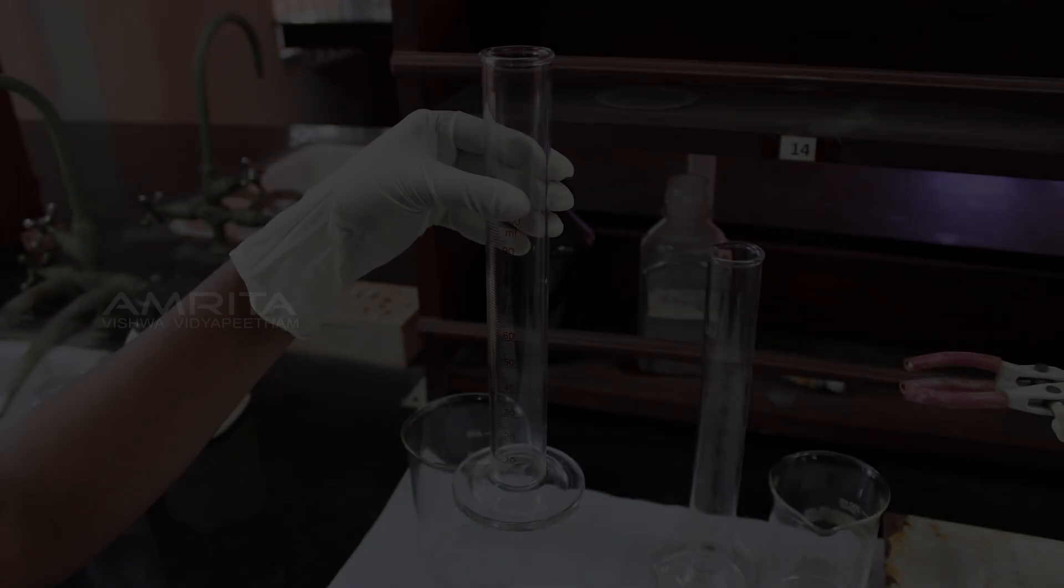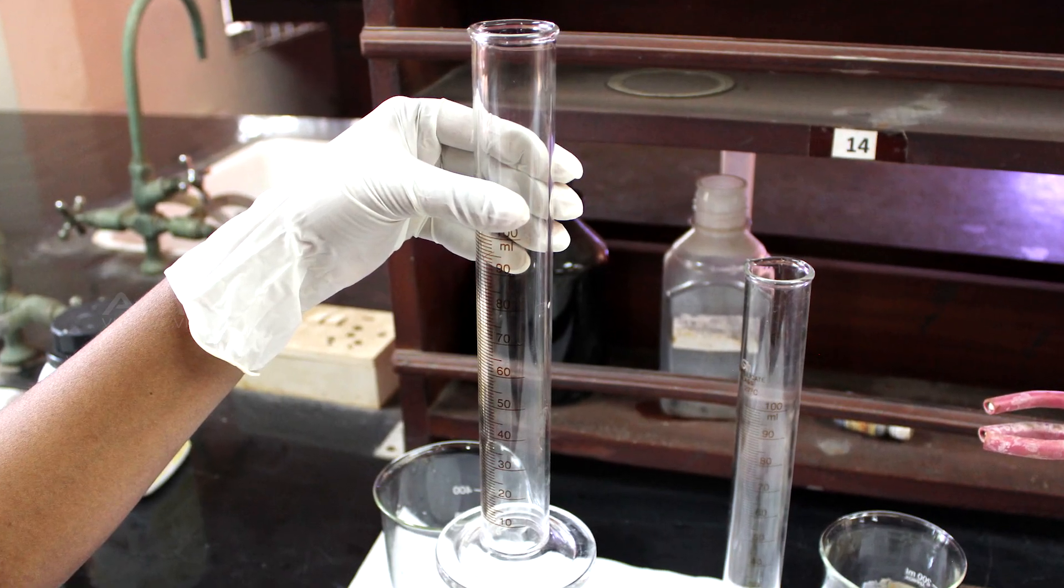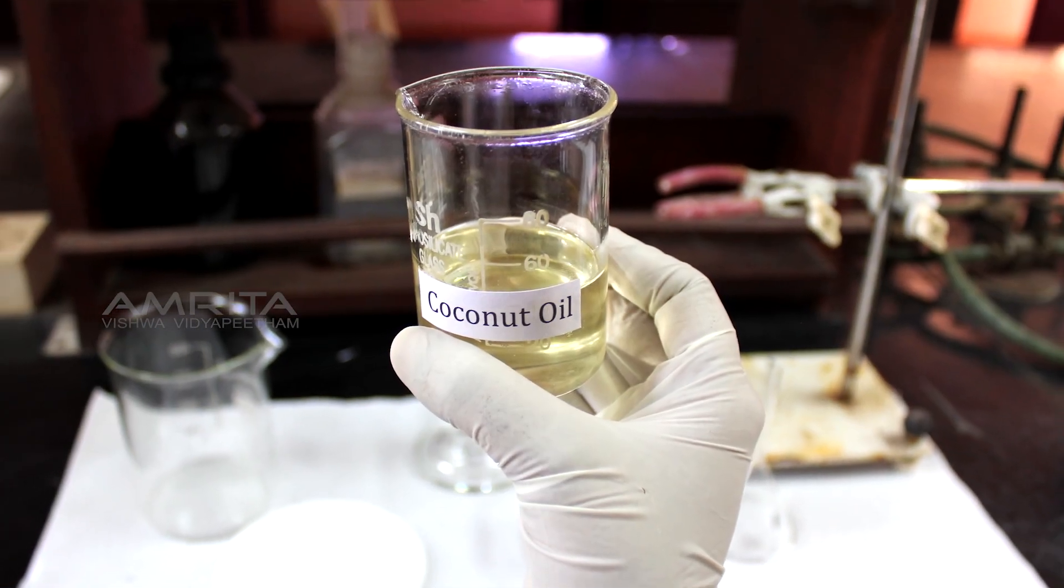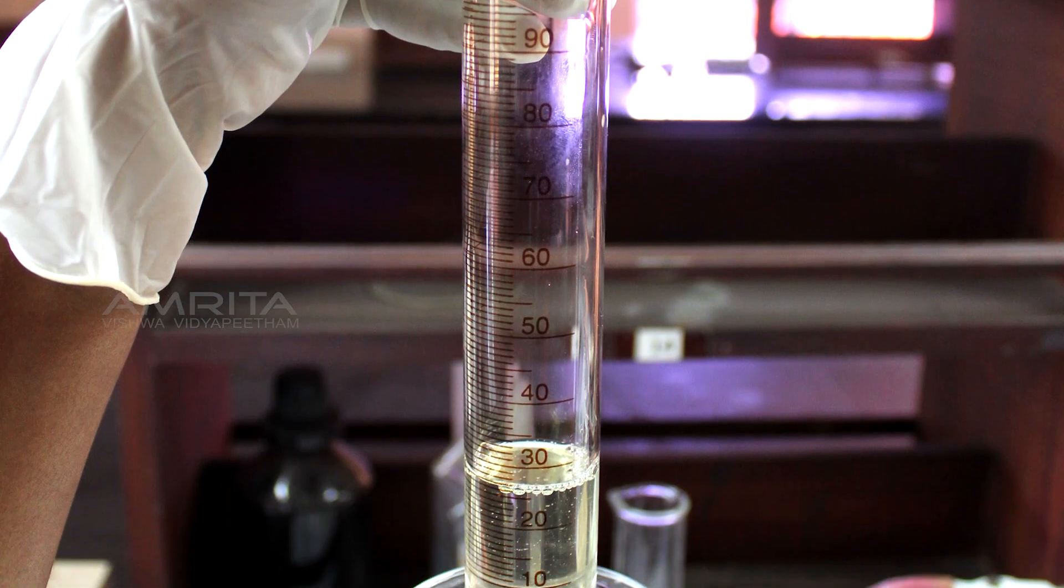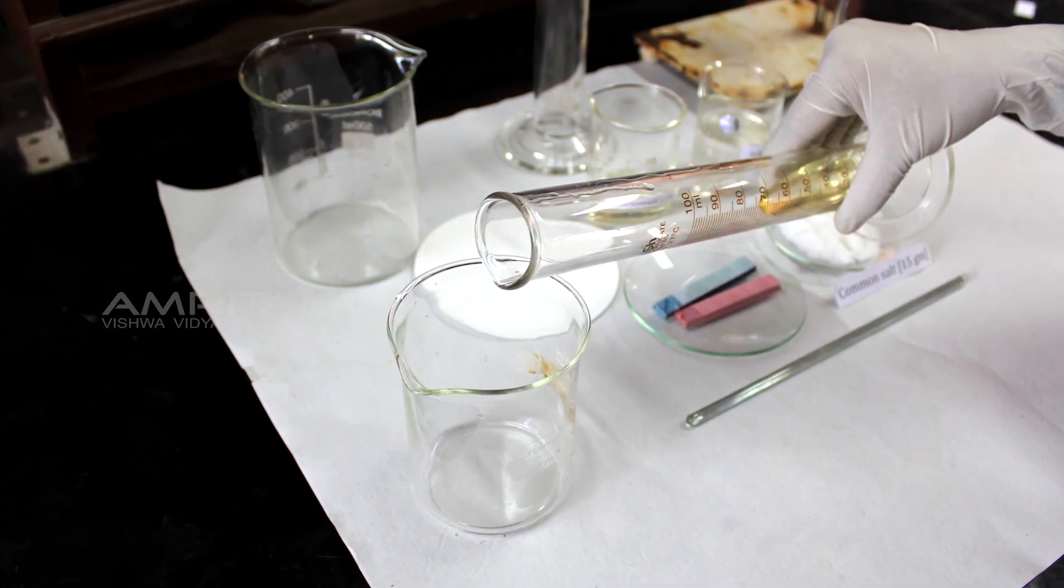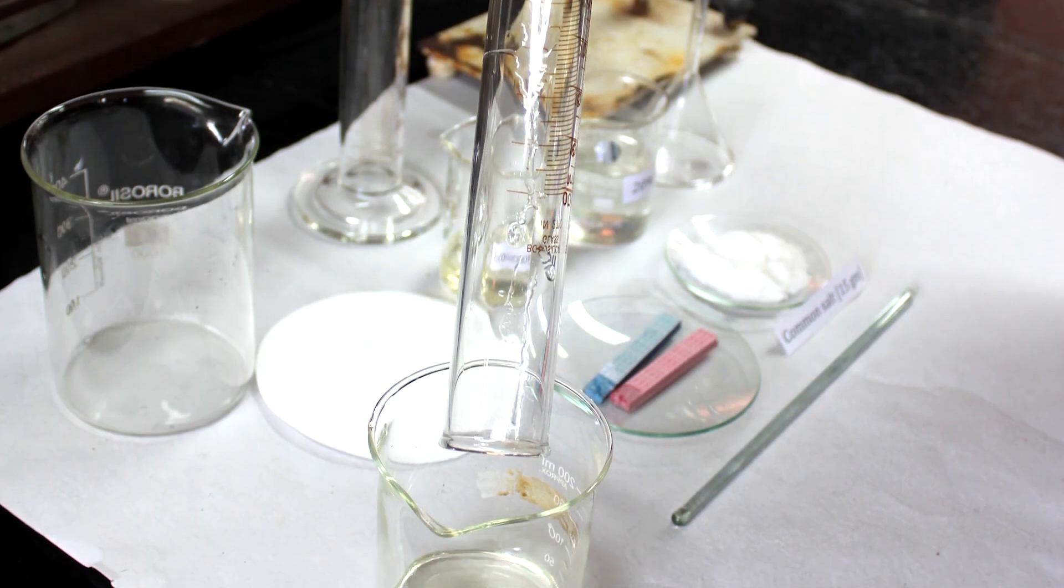Procedure: Take a measuring cylinder. Take a beaker containing coconut oil and pour 25 ml of coconut oil into the measuring cylinder. Next transfer it into a 250 ml beaker.